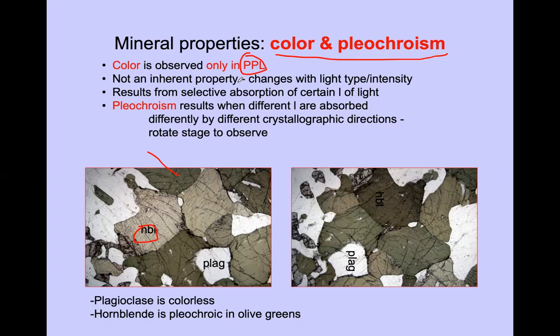With the light type, it might change in strength also, but you can still easily identify them when you get used to these minerals. Your eye should get familiar with these colors for each mineral by observing many samples. Then you can identify any unknown sample if this particular mineral is present.